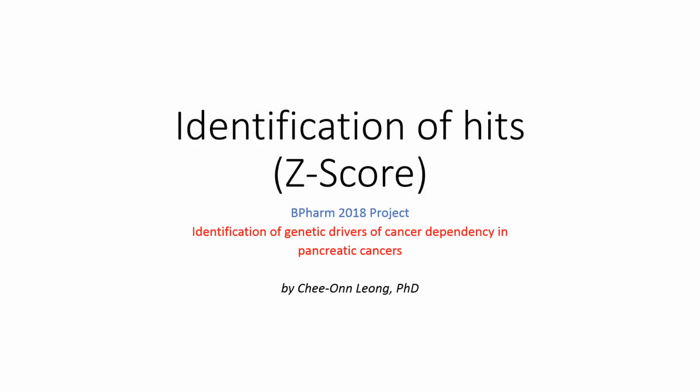In the previous video, I showed you how to normalize the data derived from the shRNA library screen. In the series of videos I'm going to show you later, that will include how you can identify the hits based on those data.